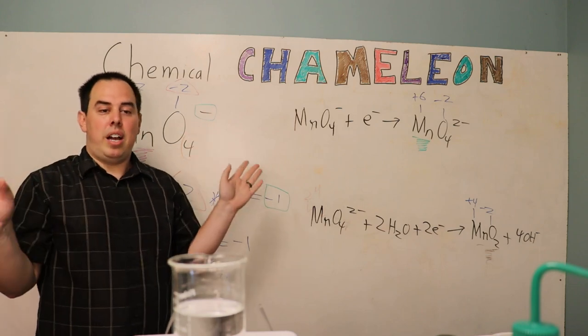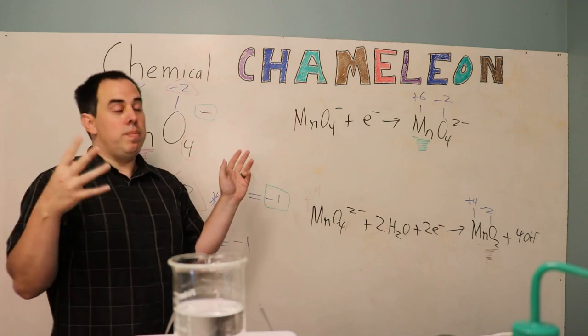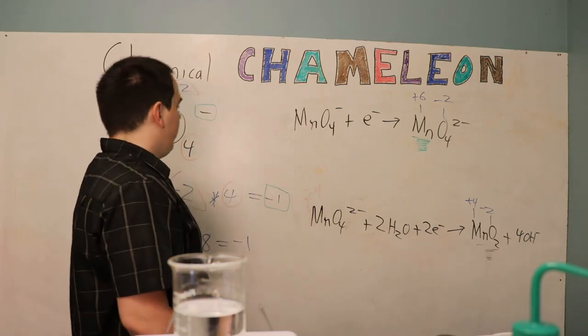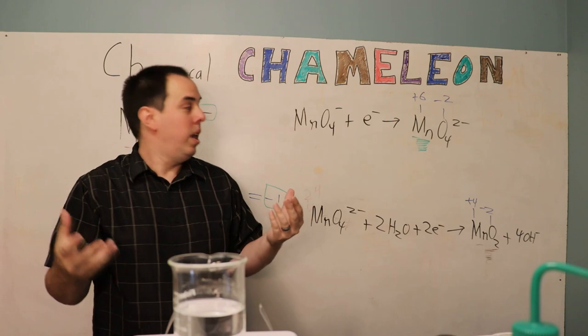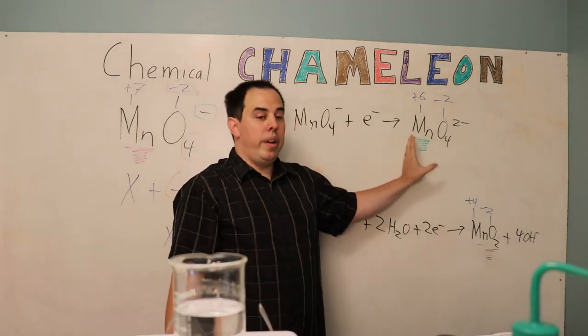Now there is a plus 5 oxidation state for manganese which is blue but we're probably not actually reaching that. It's probably just a mixture of the purple and green coming together which makes a blue color, actually a dark blue, and then it's going to rest on the green.